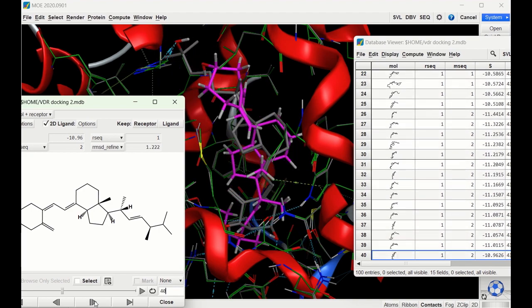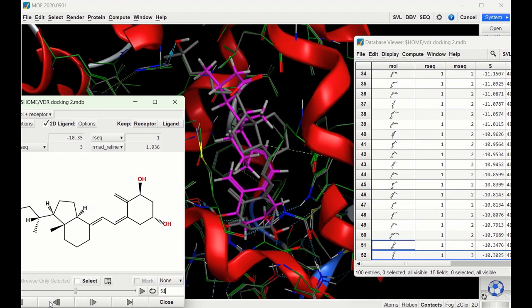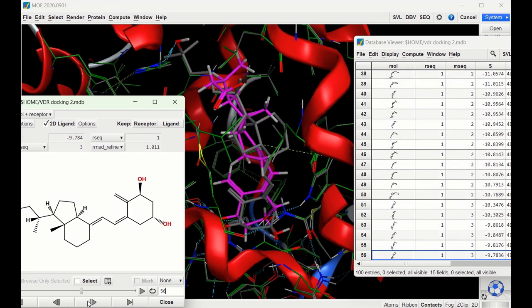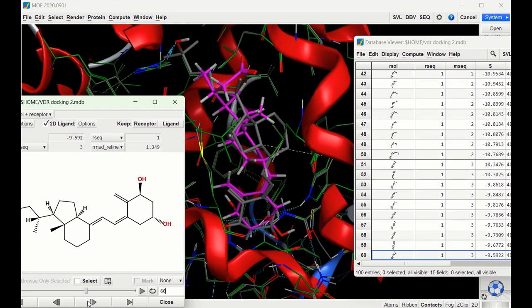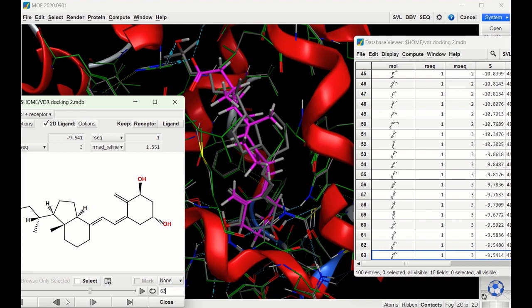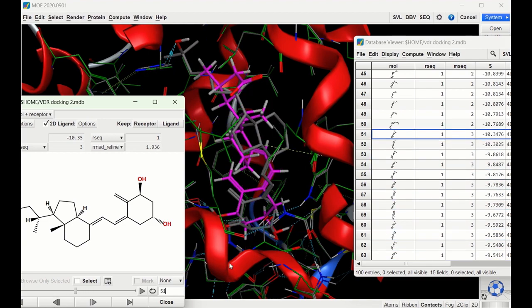For ligand three in the induced fit model, the first pose shows the ligand loosely lining up with the crystallized ligand. Going through the other poses, none line up perfectly — the six-membered ring aligns fairly well in some cases, but nothing else is perfect. Comparing to the rigid receptor model where we also never got a perfect pose, we are seeing a higher docking score here with the induced fit, which is comparable to what we'd expect.